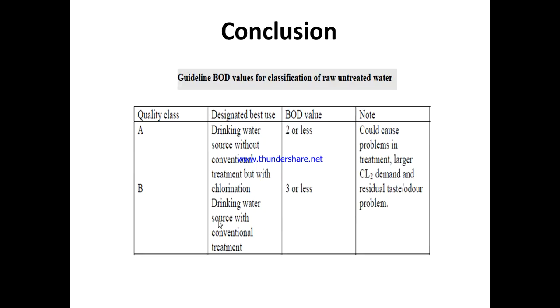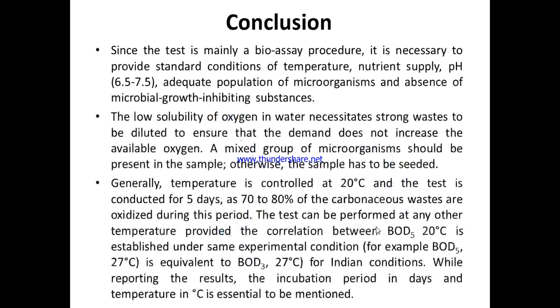Then for another water sample with conventional treatment, where treatment has been given properly, BOD values of 3 or less are expected. Note that it could cause problems in treatment, larger chlorine demand, and residual taste or odor problems might be generated.